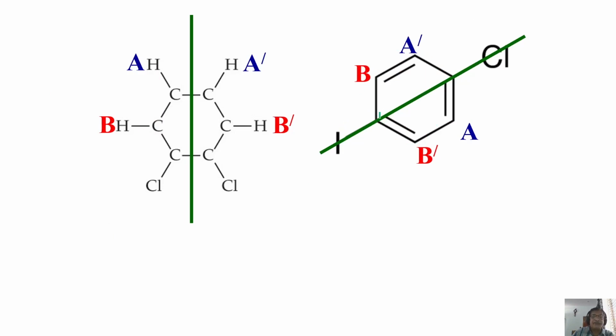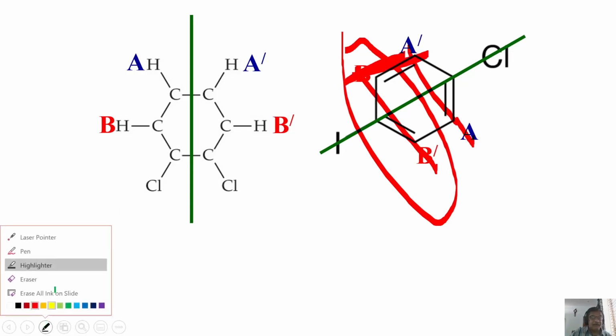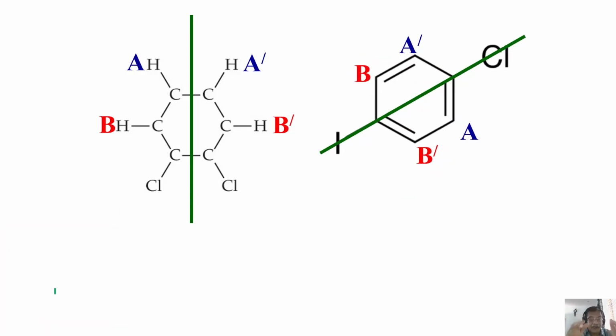If for some reason these two protons resonate far away, what do I do then? I call it AA prime and XX prime. Between these two they are strongly coupled, and between them and the others it will be weakly coupled. In a given system, one or two protons can be very strongly coupled, and with the other one there may be weak coupling. Fantastic. Many things can happen.